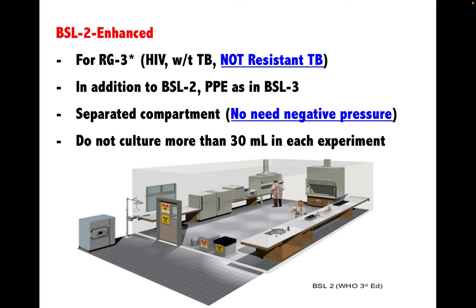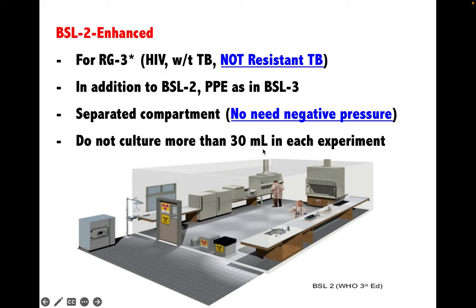There is an extra level recognised as BSL 2 enhanced, which is a higher safety level than BSL 2 but much less than BSL 3, for working with certain pathogens classified as risk group 3 star — such as HIV and wild-type tuberculosis but not drug-resistant tuberculosis. In addition to BSL 2 requirements, BSL 2 enhanced PPE follows BSL 3 standards, and the venue must be in a separately compartmentalized area. However, it is restricted to a culture volume not exceeding 30 milliliters per experiment.